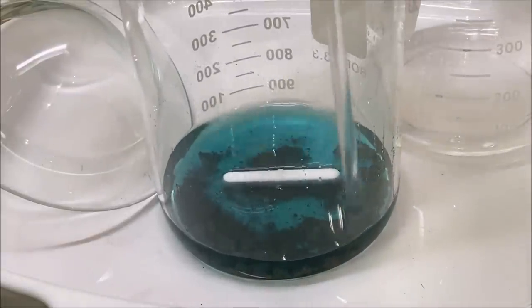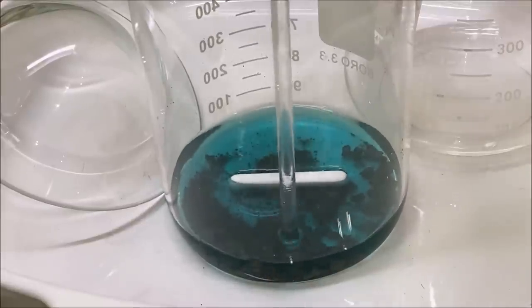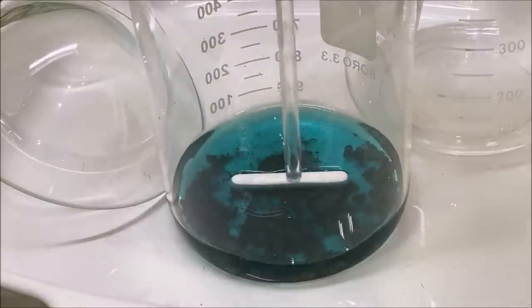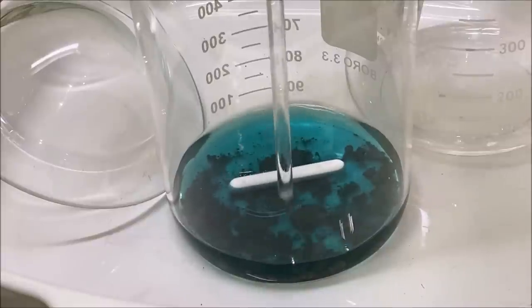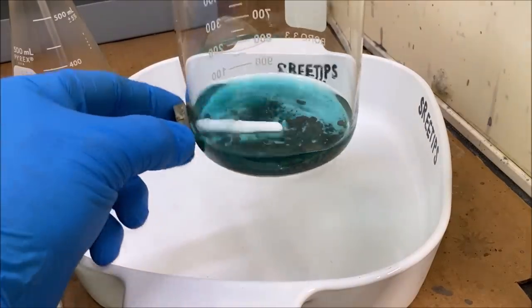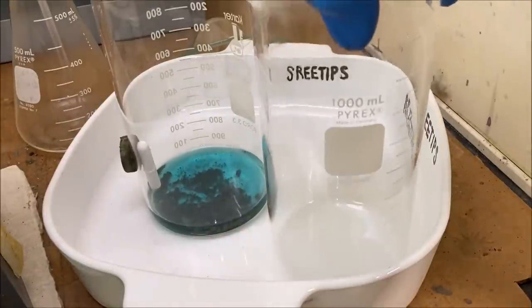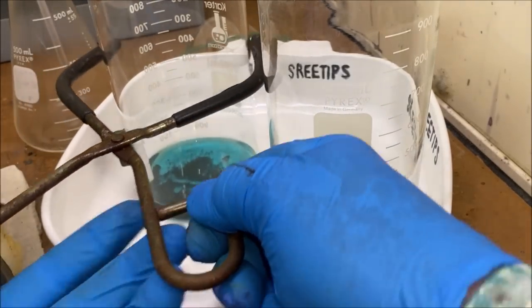Let's try to crush these up now. It's hard pieces. Yeah, I should have ground this up before we started trying to pull anything with this nitric acid. I think what we'll do now is pour off this blue liquid into a waste container. We're pulling copper out of there, which is a good thing.